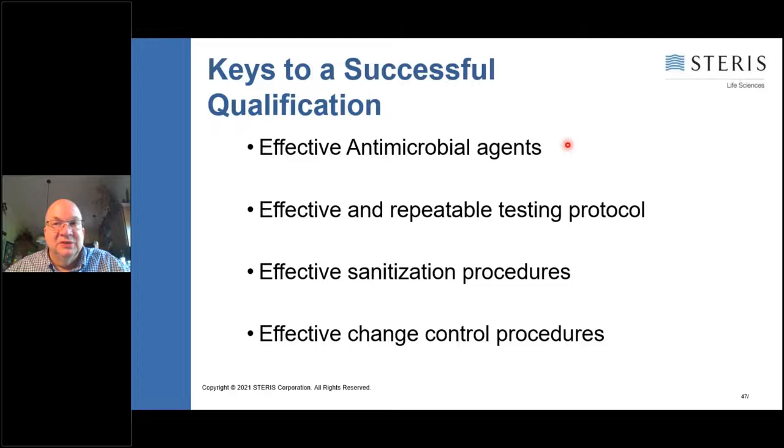You need an effective and repeatable protocol. That's why using those very big 2-inch by 2-inch or even larger 25 by 25 centimeter or inch coupons is just not going to be effective. So keep that in mind. The big coupons are not easy to work with, not easy to recover from. You need an effective sanitization procedure that you can actually get field trial data with in the clean room.